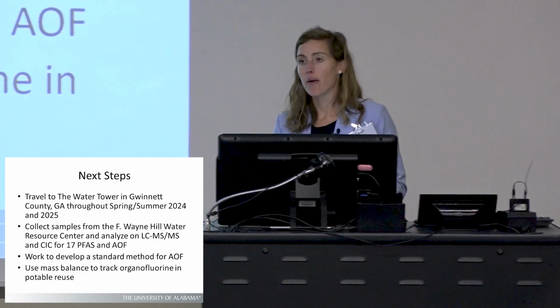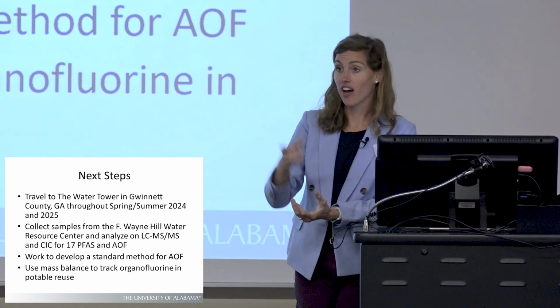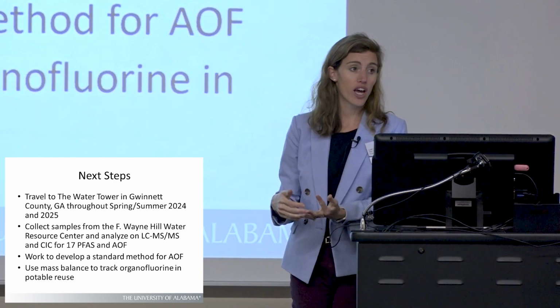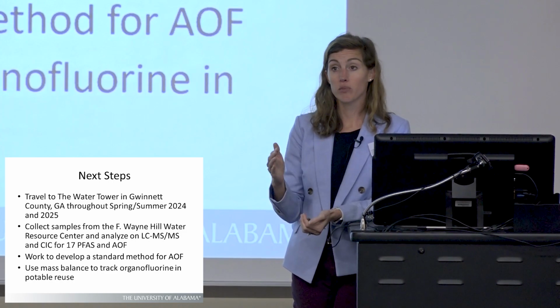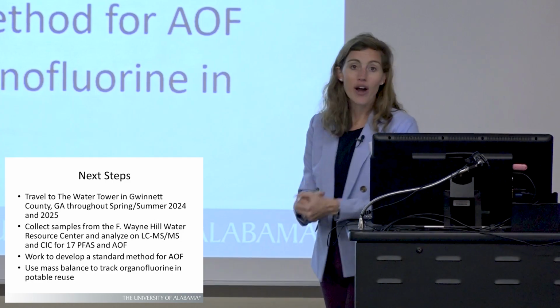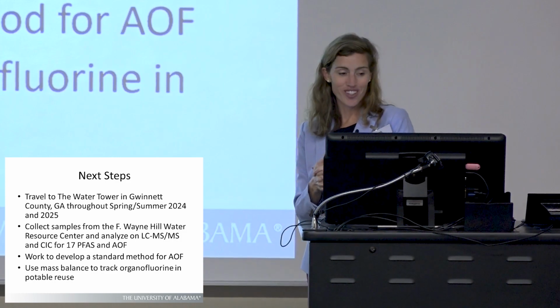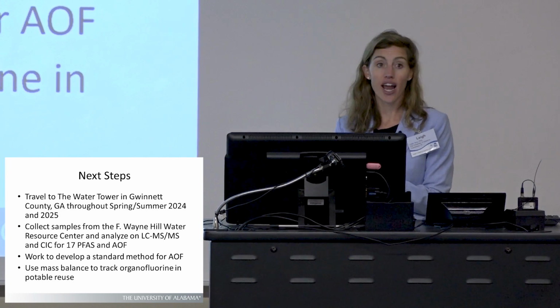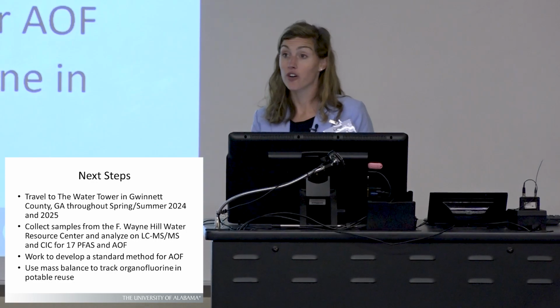So the next step: this project is just now beginning. So next week, my grad student Sarah and I will travel to Gwinnett County and we'll go work at the water tower and at this treatment plant, and we'll continue sampling throughout the spring and summer of 2024 and 2025. So I don't have any results from the project today, but hopefully we'll do this again next year and we'll have more results. But we'll collect samples from the Wayne Hill Water Resource Facility, analyze it for PFAS and organic fluorine, and then we'll work to hopefully develop a standard method for AOF.